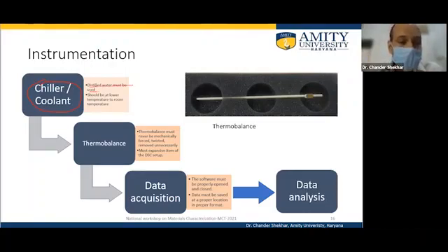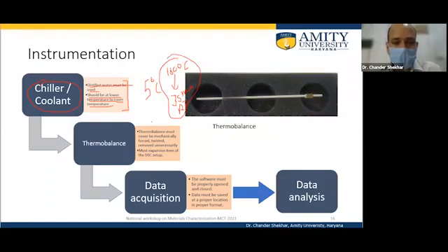Distilled water must be used in the chamber, and the temperature of the coolant must be lower than room temperature. So for example, if the coolant is at 5 degrees centigrade, from 1600 degrees centigrade the furnace can be cooled to room temperature in 35 minutes. So the temperature of the coolant is important.